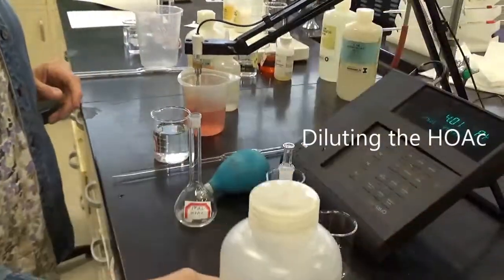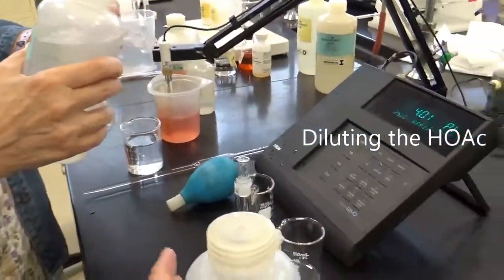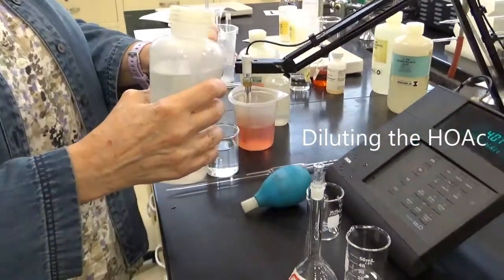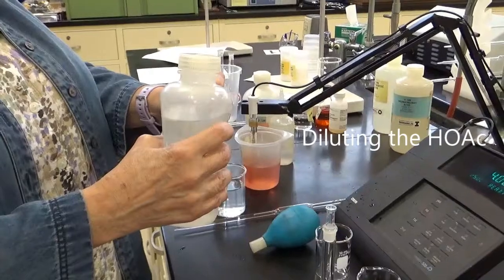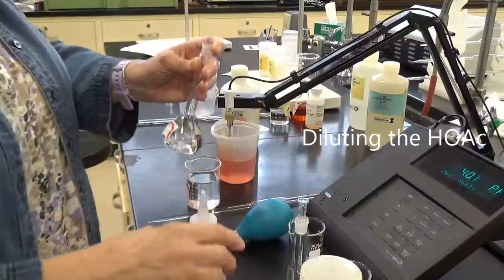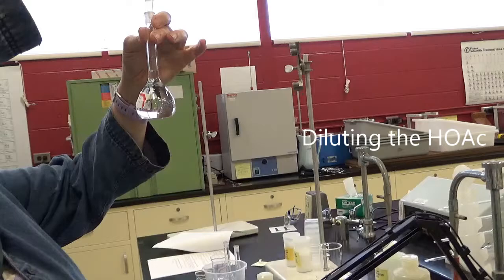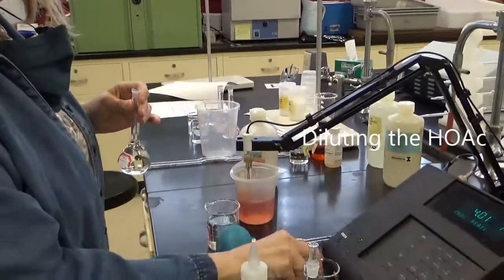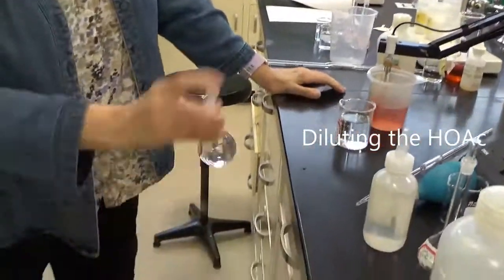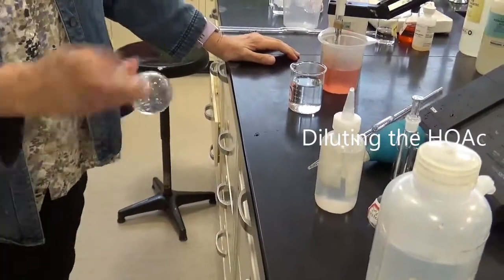Oh, I have another water bottle down there. Thank you. Almost there, so I'll use the smaller one that comes out less quickly. Good, right to the mark. And now invert and mix. 1, 2, 3, 4, 6, 7, 8, 9, and 10.